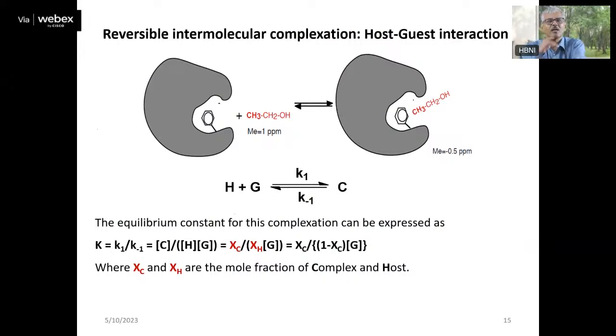Okay, so now we'll see some practical examples. Those are the calculations mostly done when the two sites are equally populated. But as I told you about host-guest complexation interaction, there you may not get 1:1. So let us see what kind of information we can extract from this kind of study.